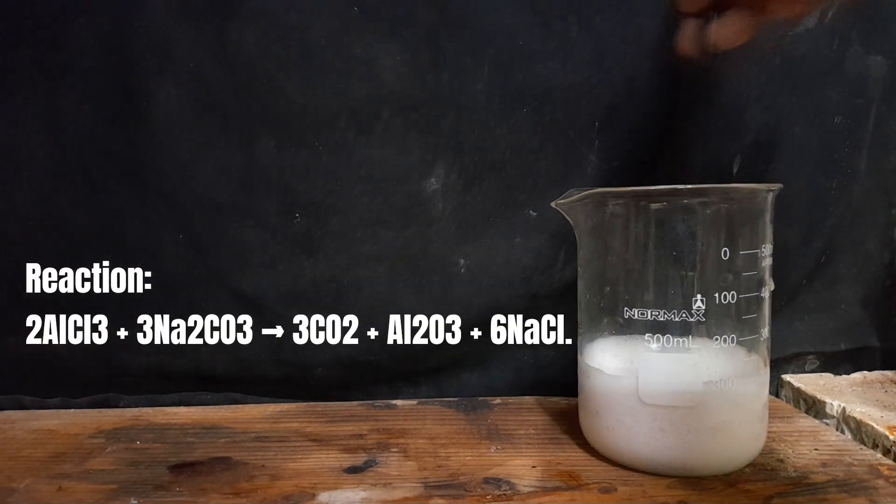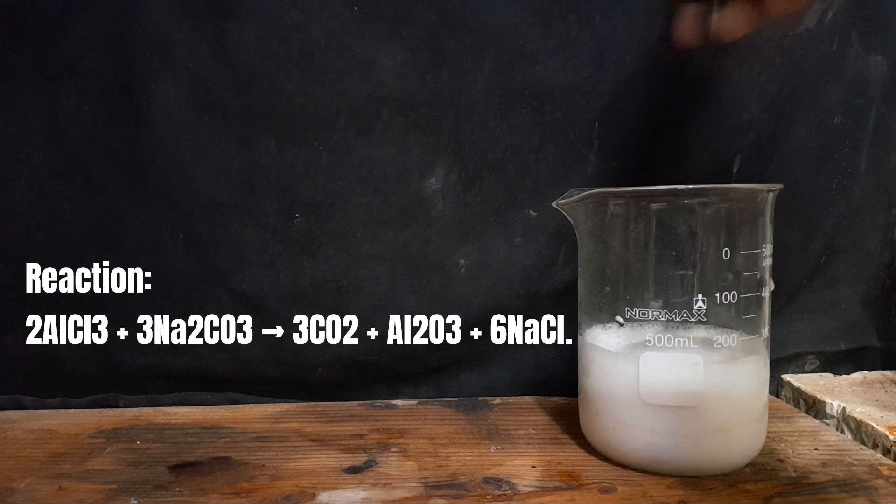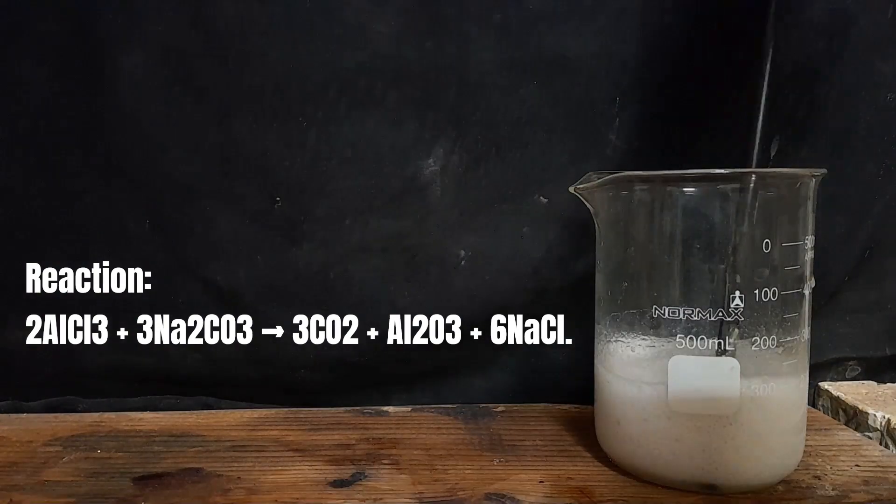Aluminium chloride react with sodium carbonate and form carbon dioxide gas, aluminum oxide, and sodium chloride.